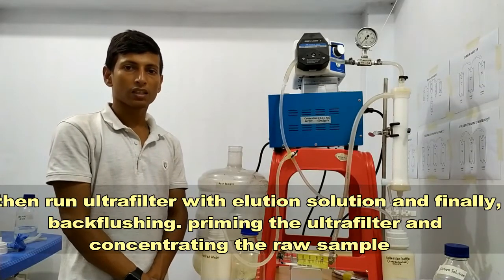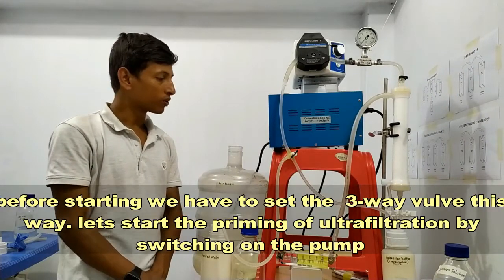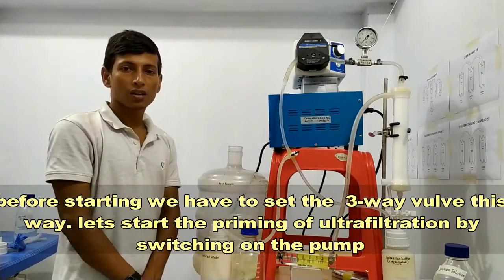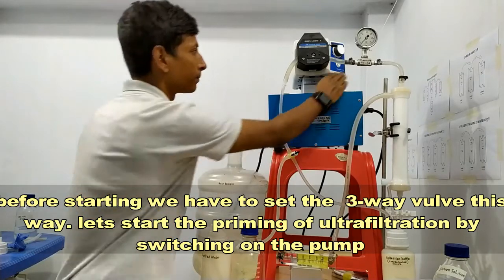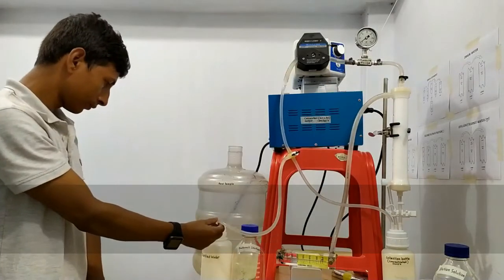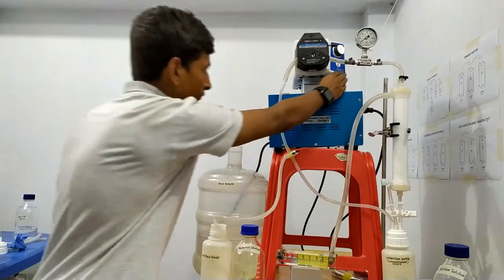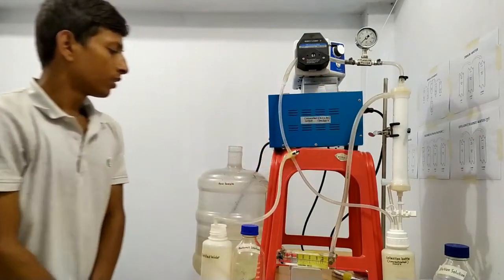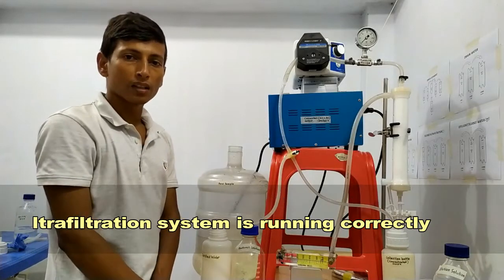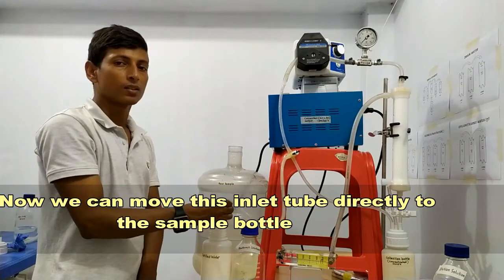For priming the ultra filter and concentrating the raw sample, before starting the priming we have to set the three-way valve. Let's start the priming of the ultra filter by switching on the pump. We found that our ultra filter is working well and the ultrafiltration system is running correctly. Now we can move the intake tube gently to the sample bottle.